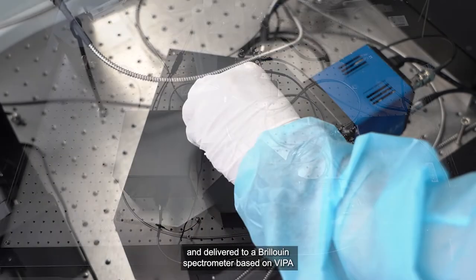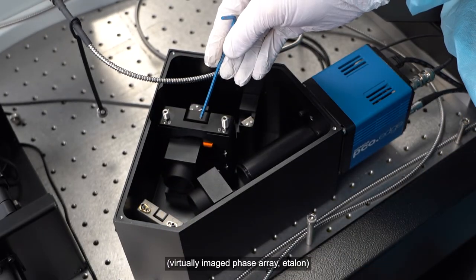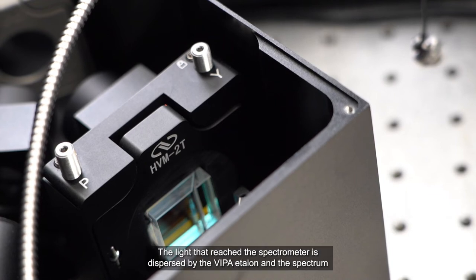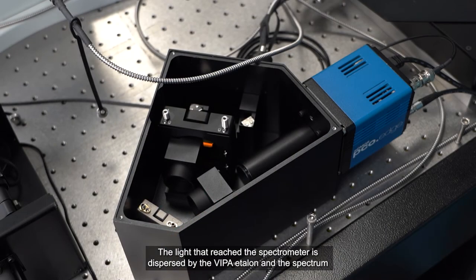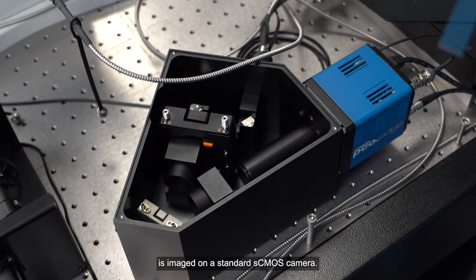Virtually imaged phase array etalon. The light that reaches the spectrometer is dispersed by the VIPA etalon, and the spectrum is imaged on a standard sCMOS camera.